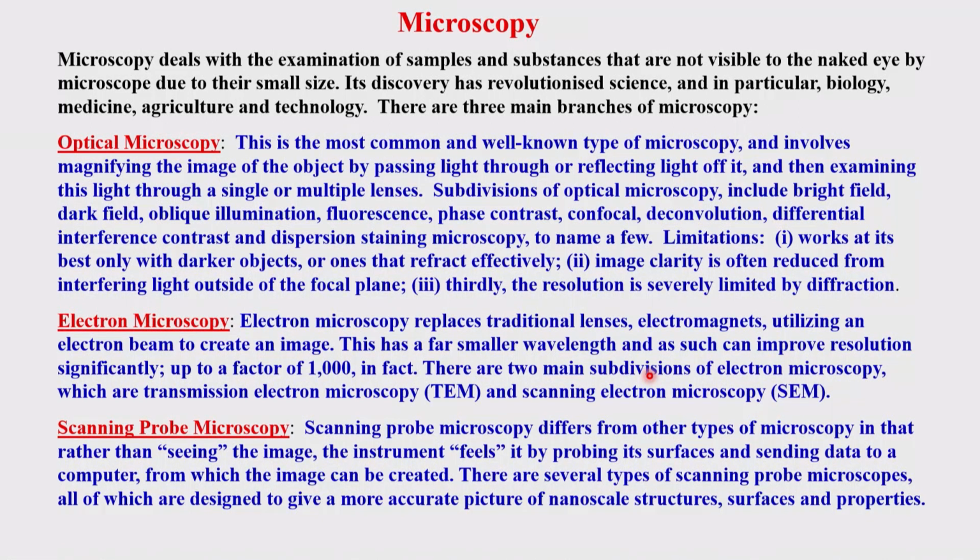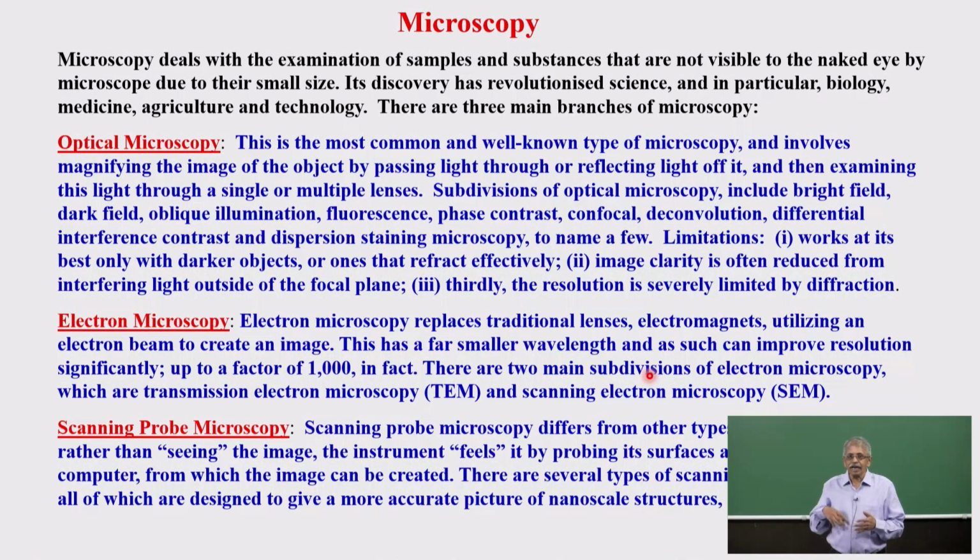So you look to electron microscopy not only to magnify but also to resolve, so that you get a proper image, can map and see the surfaces, and see through the material, thin layers of course, and structures. Many technological advancements can be utilized using those.